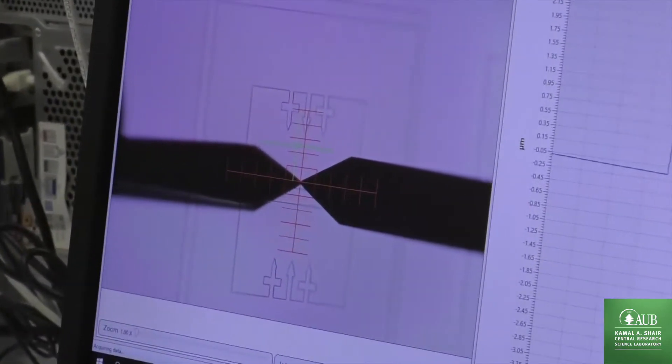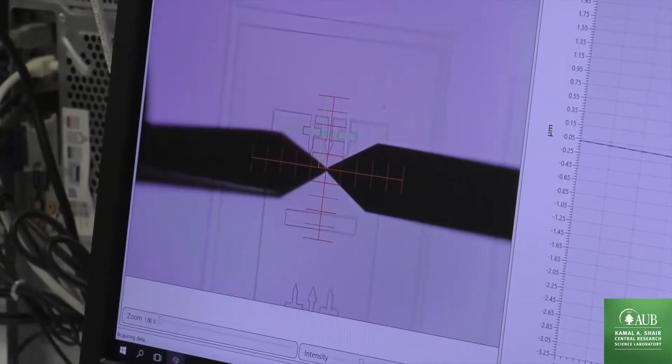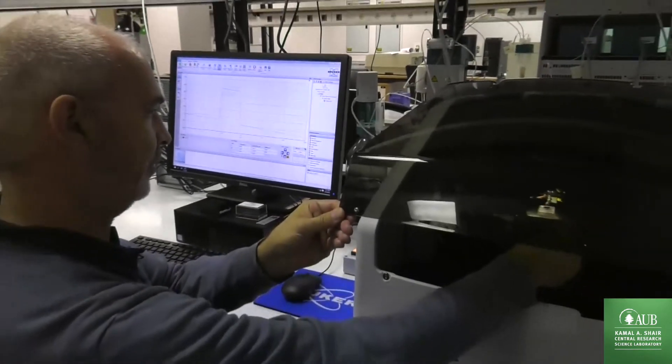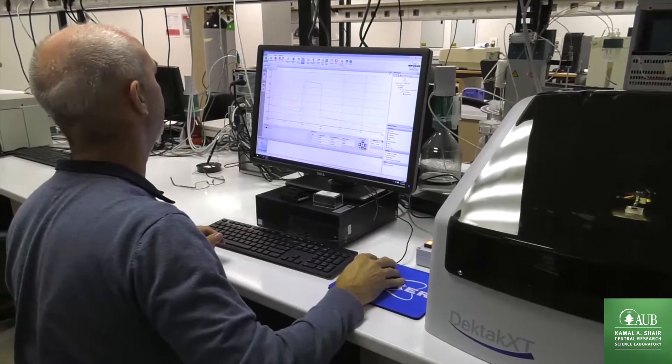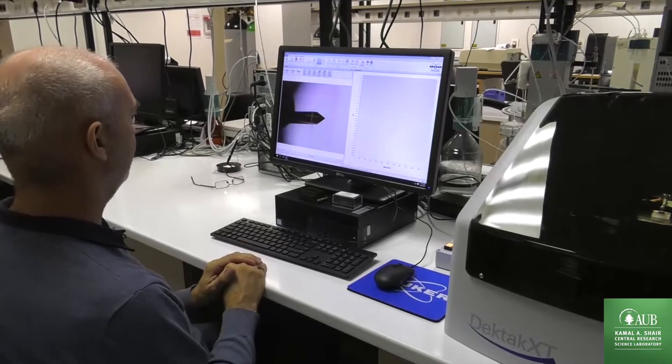You can see we are almost there. One more and I think this should be the last one for leveling.